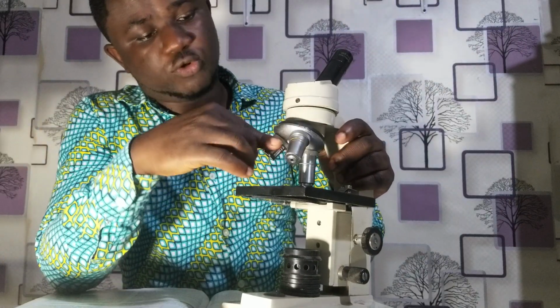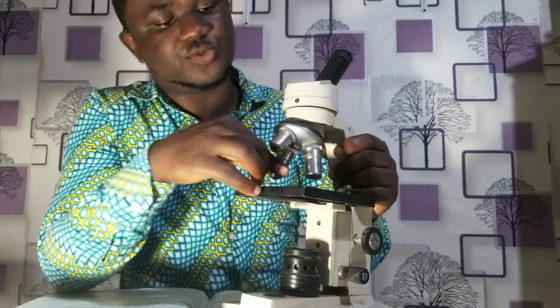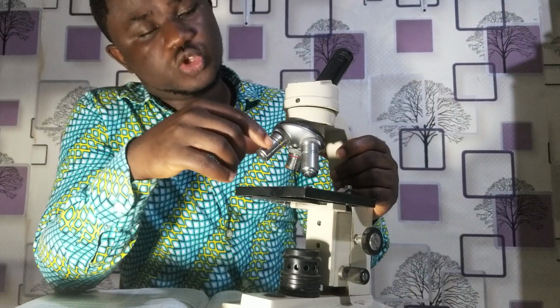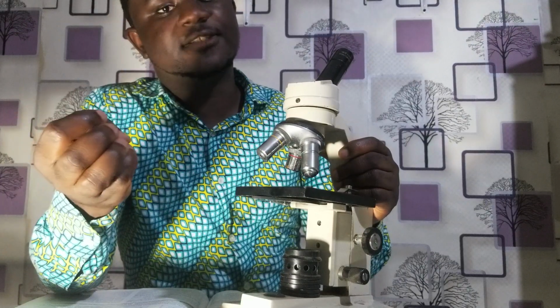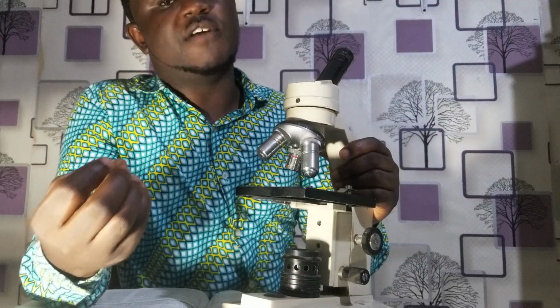So most microscopes would have 3 or 4 objective lenses. This one has 3. And mostly you have the scanning objective lens, you have the low power, you have the high power, and then you have the oil immersion lens. We'll talk exclusively about the oil immersion lens and the various types of objective lenses in a dedicated tutorial on magnification. And so let's expect that.